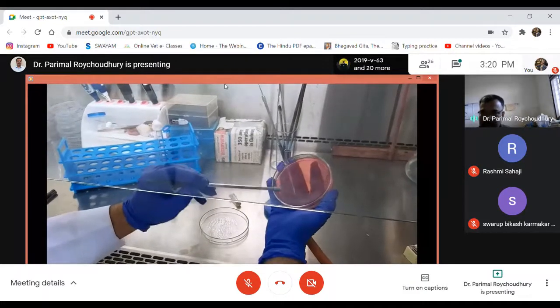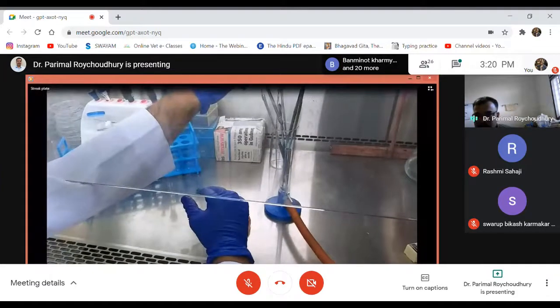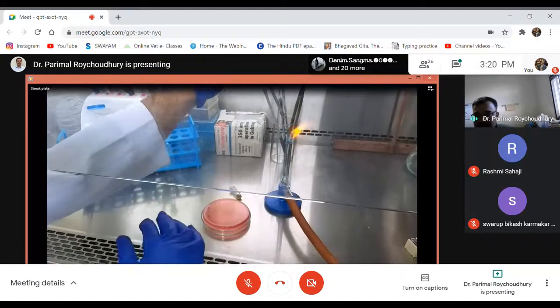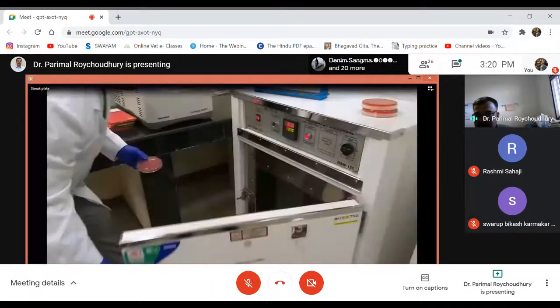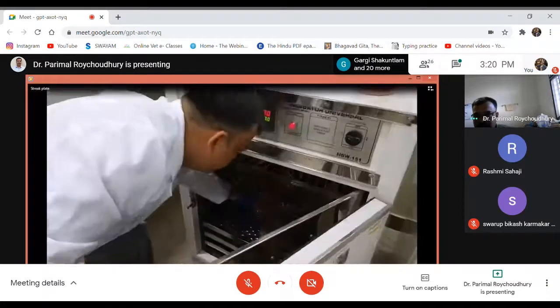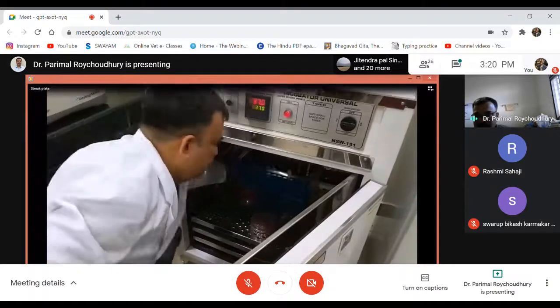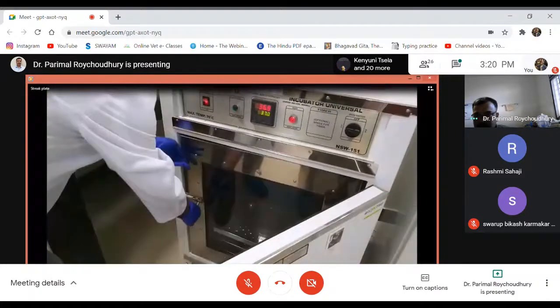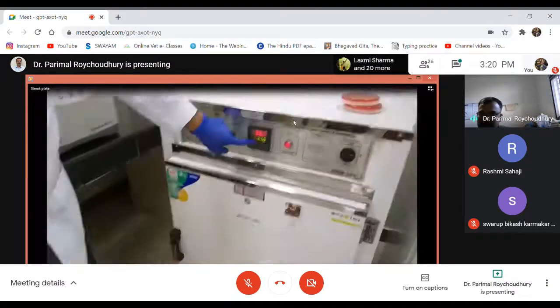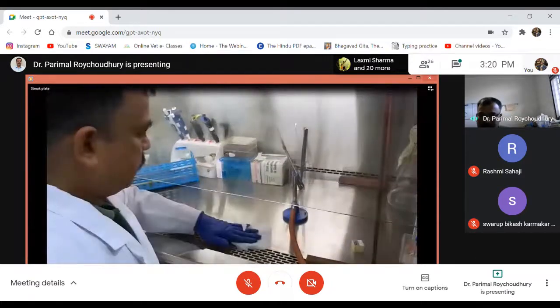By this method, you can physically separate the bacteria from the pool to the other part of the plate, so that in the final streaking line, the individual bacteria remain single and can be transformed into colonies. So we'll keep the broth and the culture plate in the incubator, and then we'll incubate it. And as you know, these are mesophilic bacteria. At 37 degrees centigrade, we adjusted the incubator, so we incubate it.